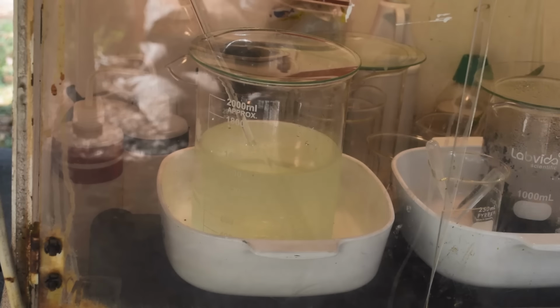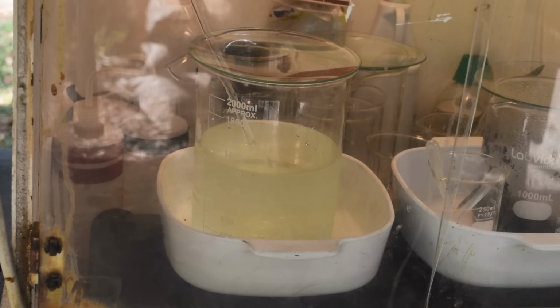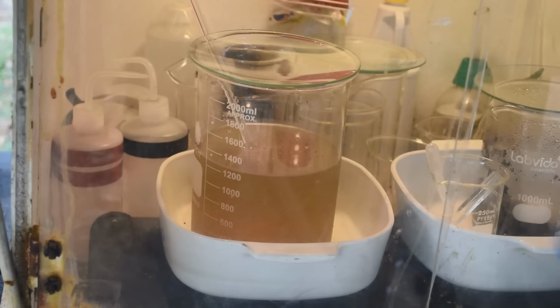Probably about time I turn the camera off, the way it always works. But just let it sit, do it in its own time. Yep, there we go. I turned the camera off, walked away for a minute, turned around, came back, and well, we're getting the gold drop. It's darkening up by the second. Okay, a little bit of a delayed reaction.